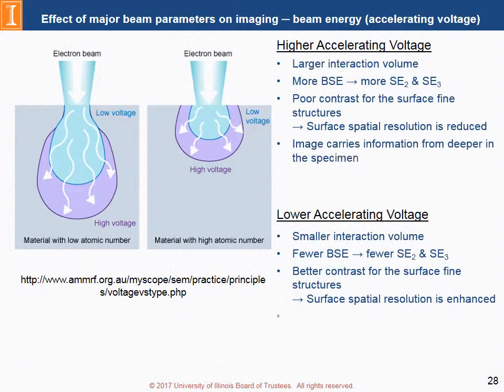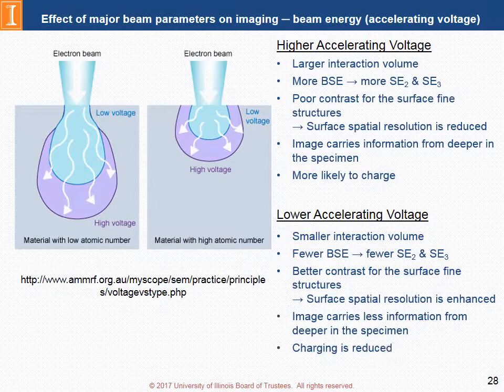At the same time, the image will carry more information from deeper in the specimen for a higher energy beam. Also, it will be more likely to be charged, and there will be larger specimen damage.